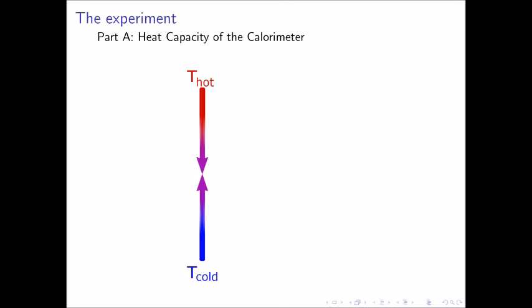Since we have equal masses of water, we should expect that the final temperature should be exactly the midpoint between the hot water temperature and the cold water temperature. This is because the heat energy released by the hot water is completely absorbed by the cold water, and the resulting temperature should be the midpoint. What we will observe is a little bit different.